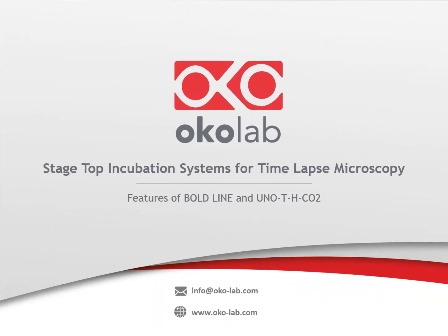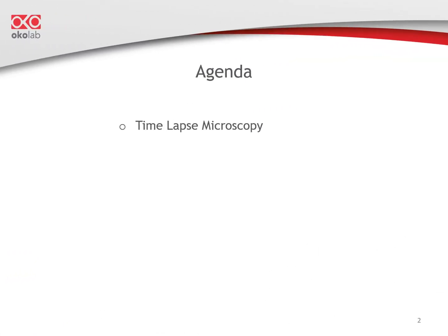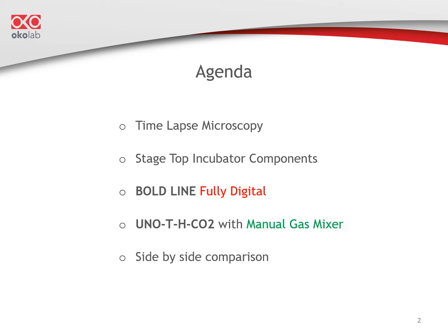This is an overview of Okolab stage-top incubation systems for time-lapse microscopy. Here's what we'll cover. What is time-lapse microscopy? What are the components of a stage-top incubator? What are Okolab's stage-top incubation offerings, Bold Line fully digital and UNO THCO2? We will then compare them side by side.